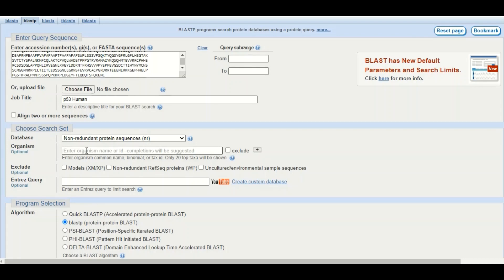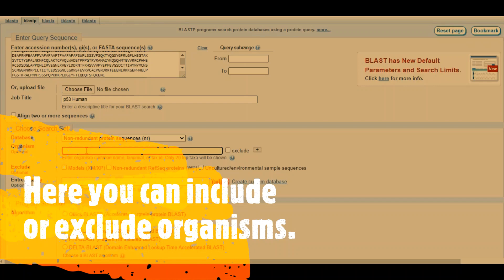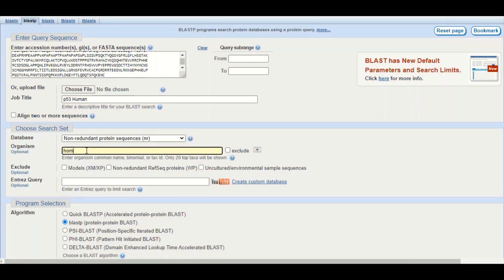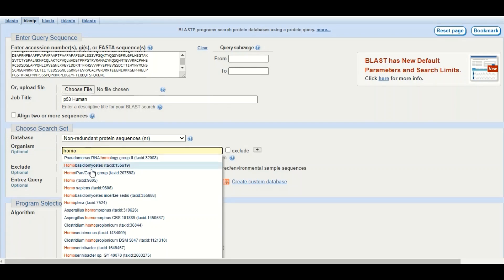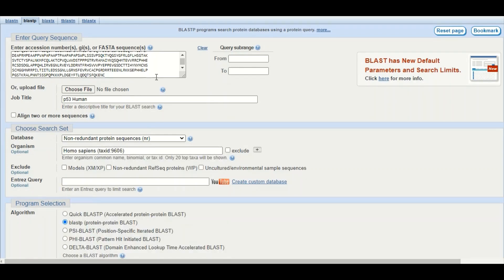In the next tab you can select a specific organism to confine your searches to. For example, if you are only interested in homologues of your protein sequence in humans, you write 'Homo sapiens' here, and only sequences homologous to your protein in humans will appear in the search results. You can also exclude an organism by clicking the exclude button — for instance, excluding Homo sapiens means human sequences will be removed from results. The other two options are optional and can be safely ignored.